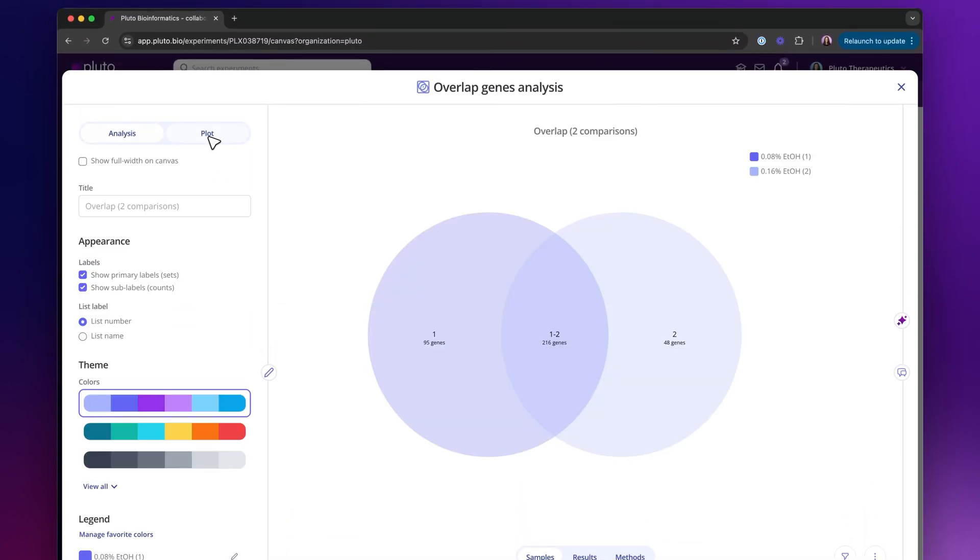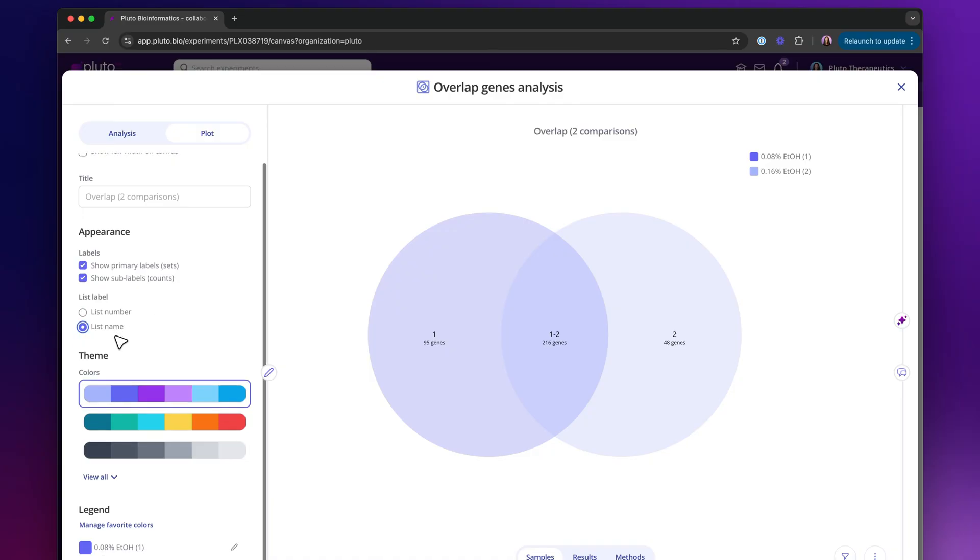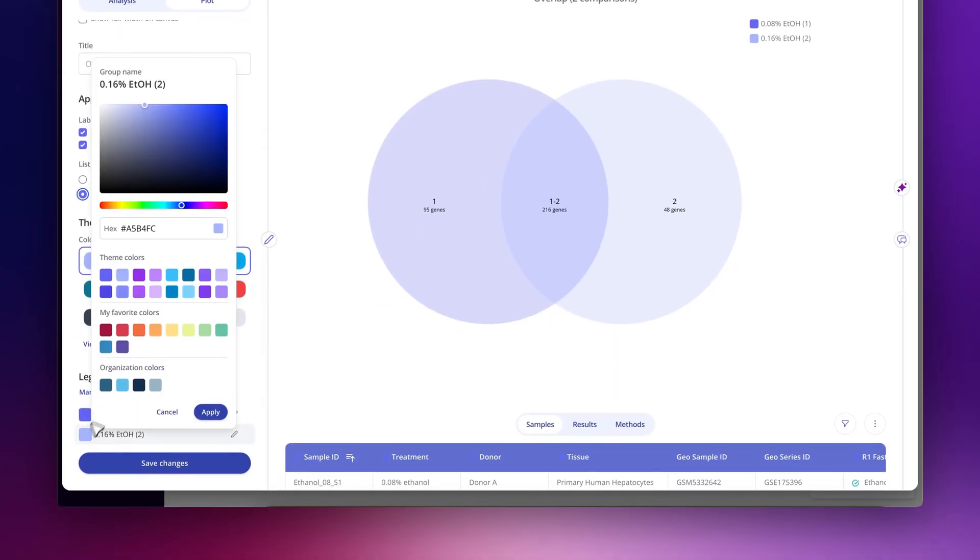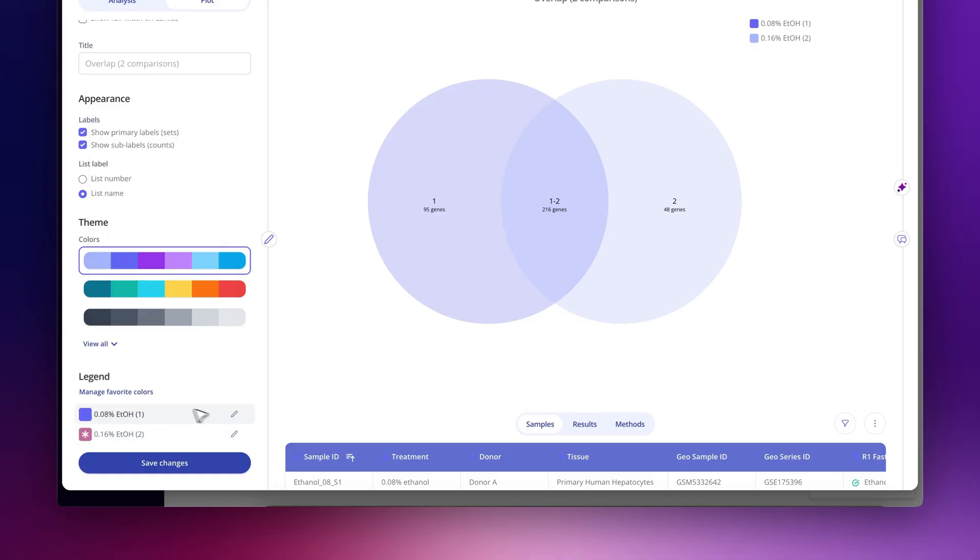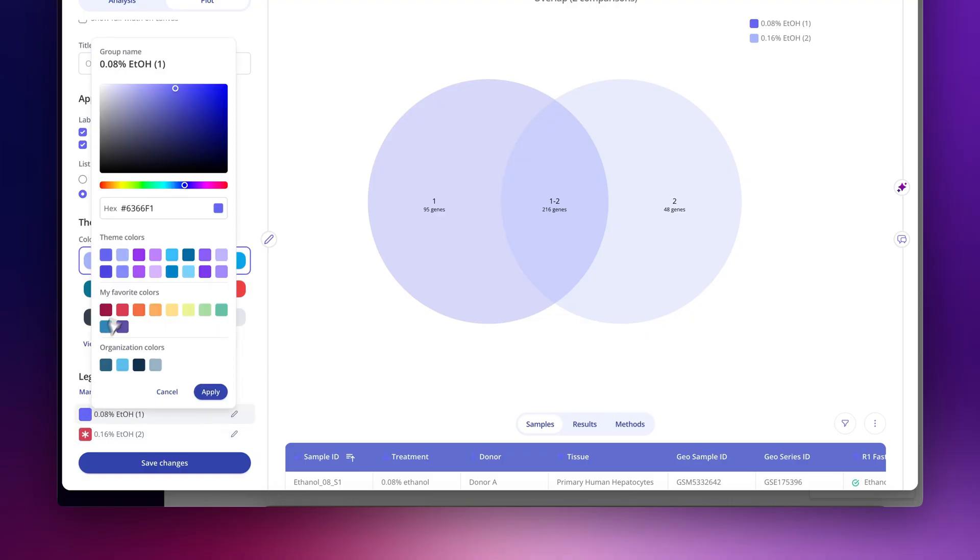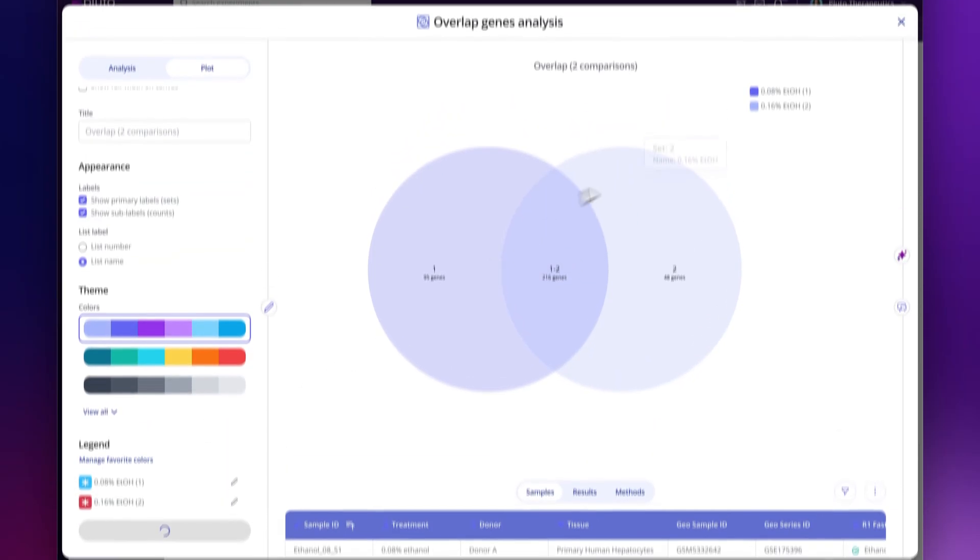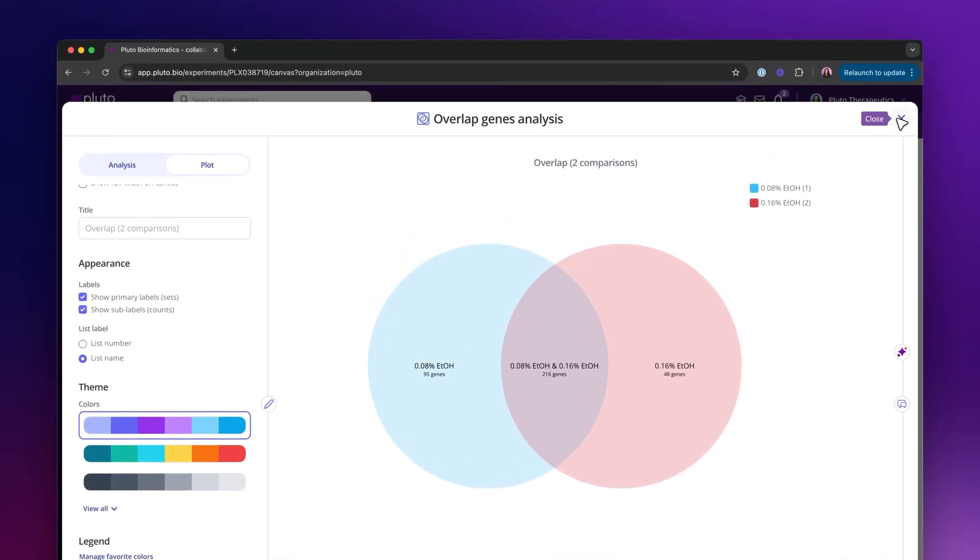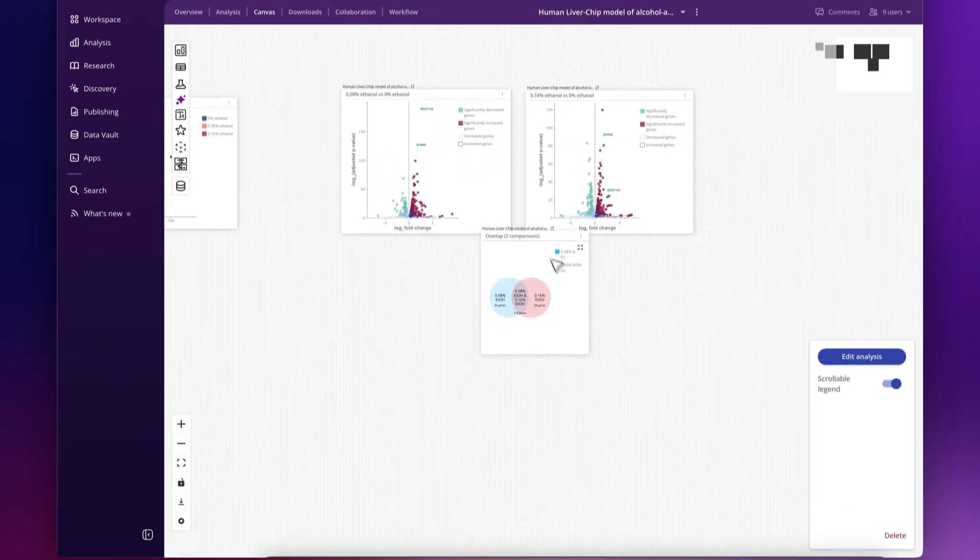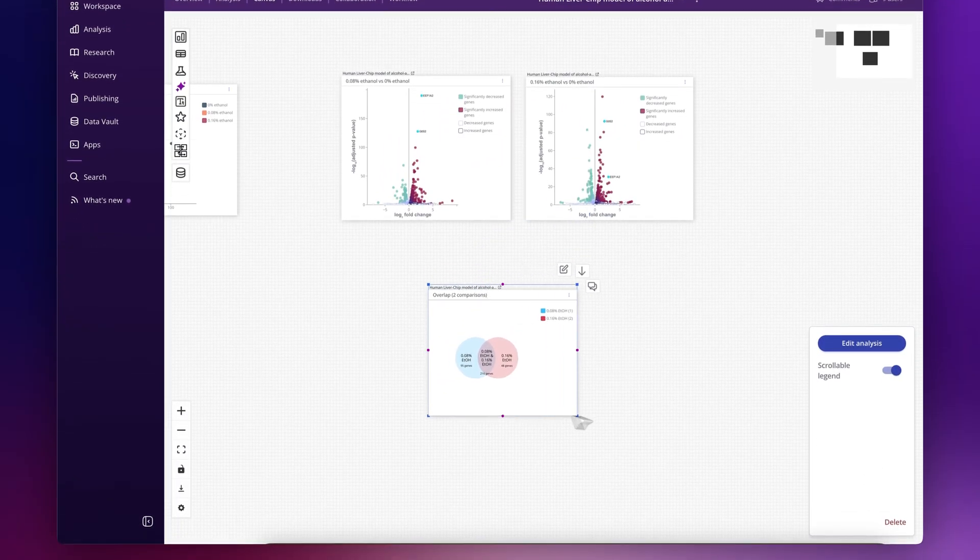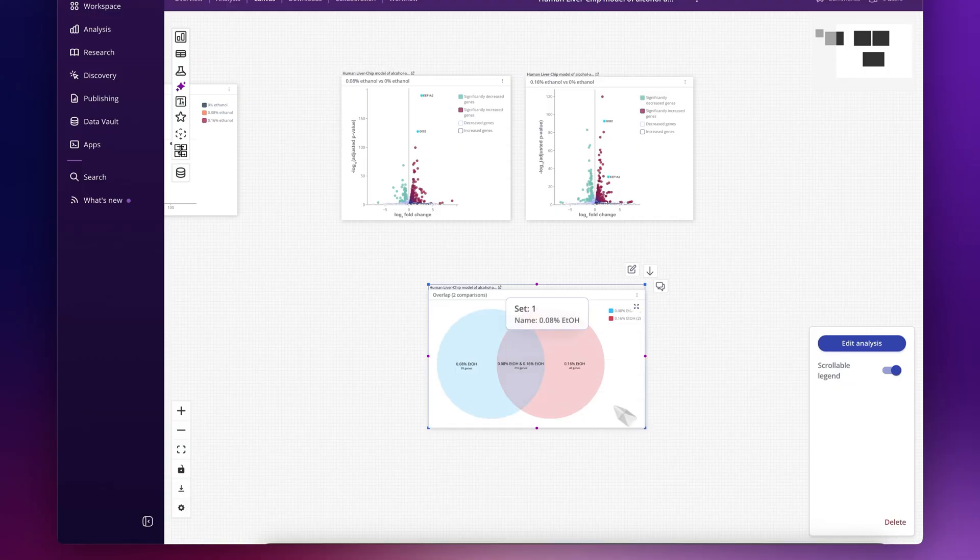I can customize this Venn diagram, show the names of the groups that I'm looking at, and change those colors. And now we have a nice looking Venn diagram for these two comparisons.